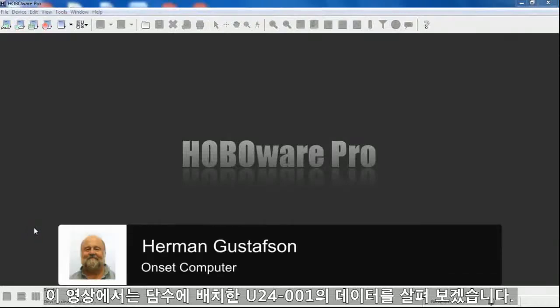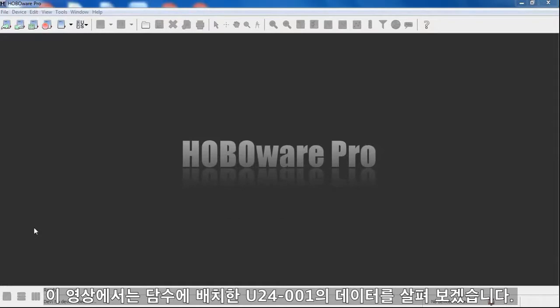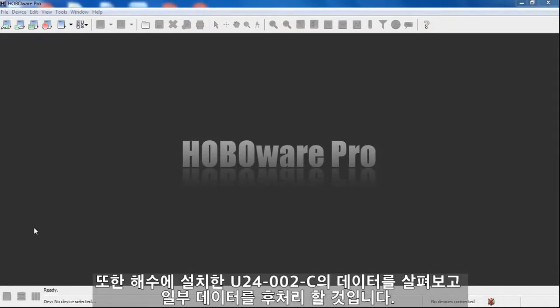In this video, we're going to look at some data from a U24-001 in a freshwater deployment. We're also going to look at some data and post-process some data from a U24-002C in a saltwater deployment.